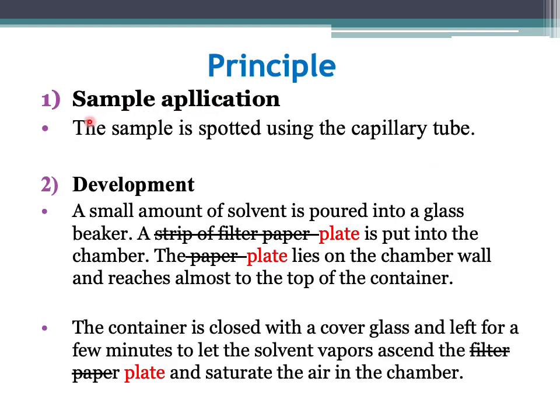Okay, this is the principle for TLC. For the first one, sample application. The sample is spotted using a capillary tube. Kita letak spot pada atas kita punya stationary phase.